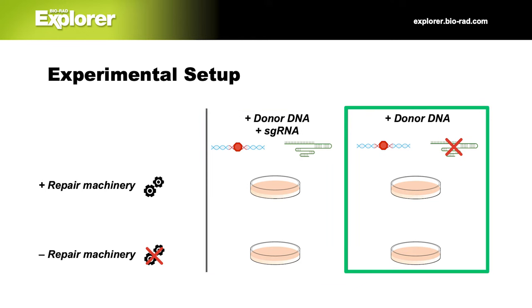What would you expect to see if the DNA within lacZ is cut and repaired with a stop codon? What if it's cut and not repaired? What if it isn't ever cut? Think about which of these you'd expect to see for each of your plates.